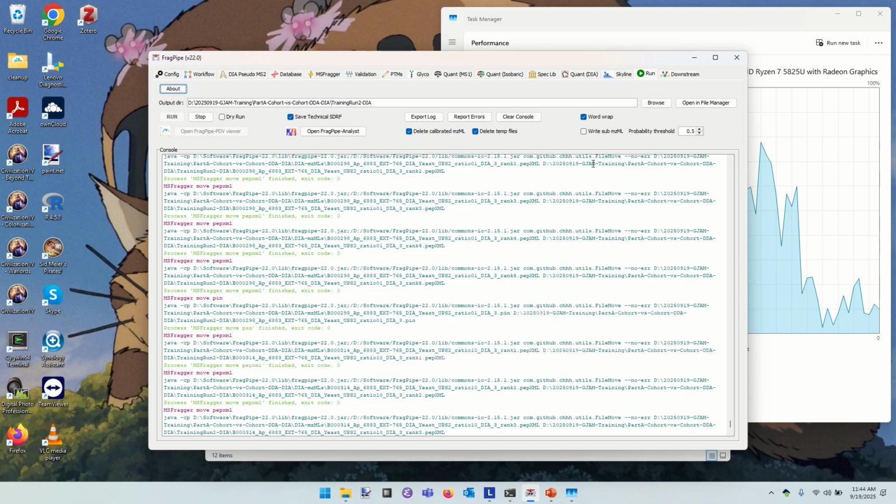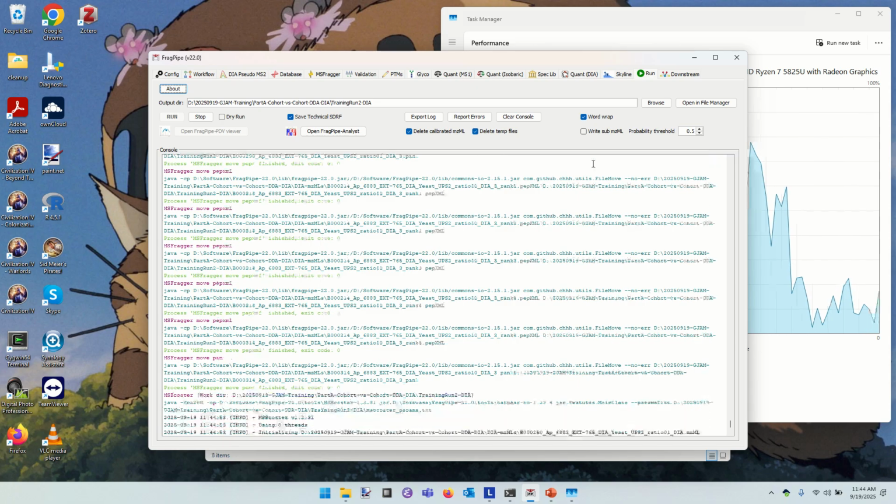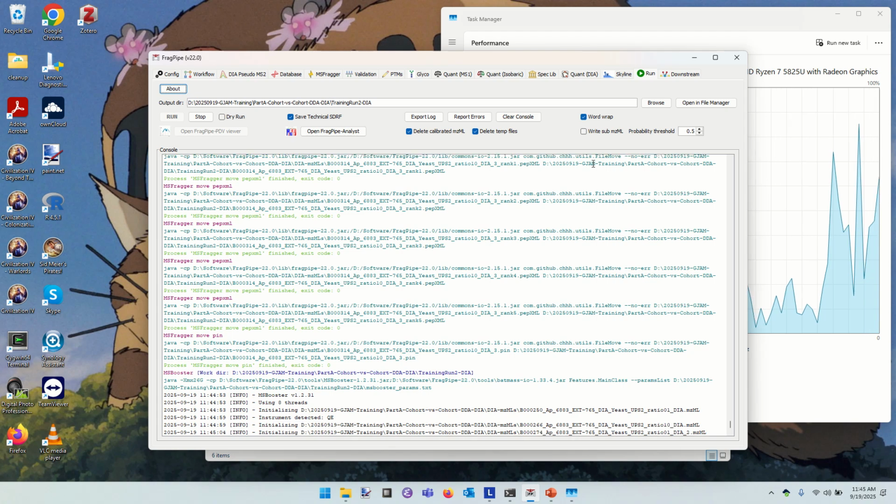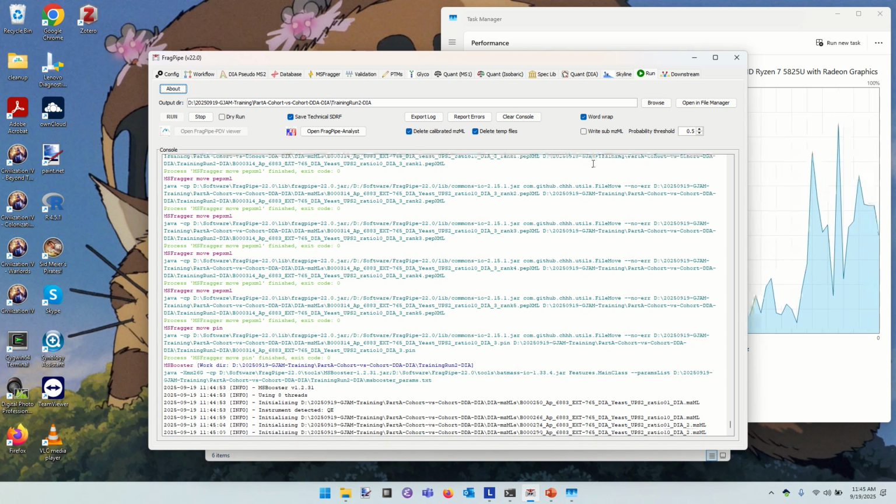Yes, sir. I would make a more mass spectrometer question. Do you have a suggestion on the optimal data points per peak? The optimal data points per peak for the quantification, the number of points to characterize a peak.